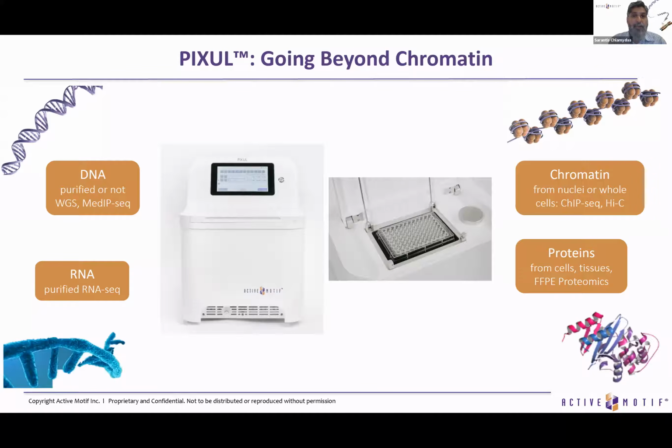We have tried DNA for applications like MeDIP-Seq, RNA for RNA-Seq, chromatin to prepare ChIP-Seq and later on libraries for sequencing, and proteins from different tissues and cells, also FFPE samples.